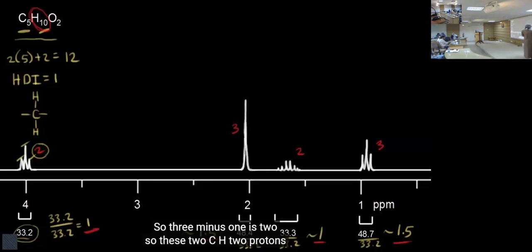And then O here, that is isolated from the rest. Good.